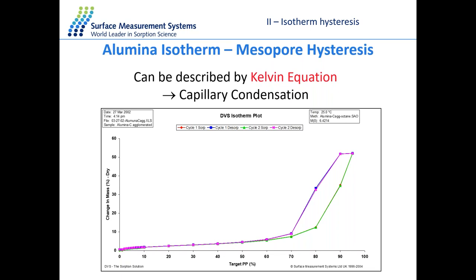What I mean by mesoporous material is a porous material that has very large pores that can contain multiple molecules of water. So think about this sample as a giant cage. What we are looking at here is more of a honeycomb-shaped structure. There is a lot of empty space. The structure of the sample is mainly empty. What you're looking at as the solid part of the structure is only the corner of this honeycomb shape.